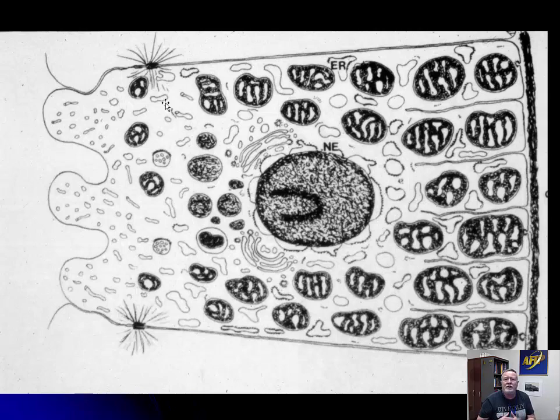So you're starting to see maybe the Golgi will float away from the nucleus, and the mitochondria will float away from the part that they need to congregate because it's highly metabolically active. If the nucleus is normally basal, like we'll see in secretory cells, it may be floating up at the apical surface and intermix with whatever granules are normally there. So the late stages of reversible cellular degeneration are characterized by disassociation of the cytoskeleton and changes with that.